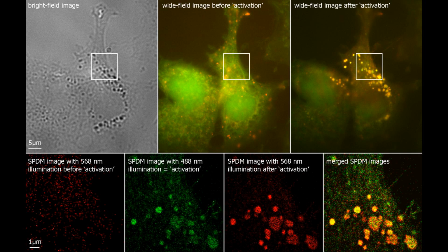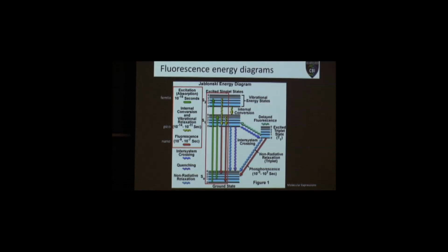FLIM imaging is particularly useful in neurons, where light scattering by brain tissue is problematic for ratiometric imaging. In neurons, FLIM imaging using pulsed illumination has been used to study RAS, CaMKII, RAC, and RAN family proteins. FLIM has been used in clinical multiphoton tomography to detect intradermal cancer cells as well as pharmaceutical and cosmetic compounds. More recently, FLIM has also been used to detect flavanols in plant cells.